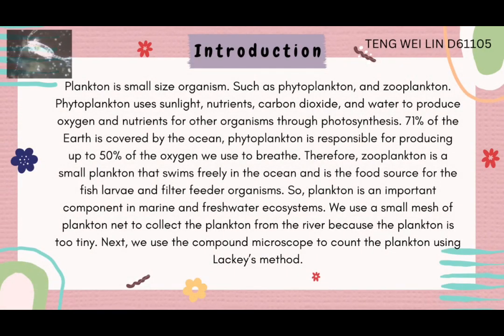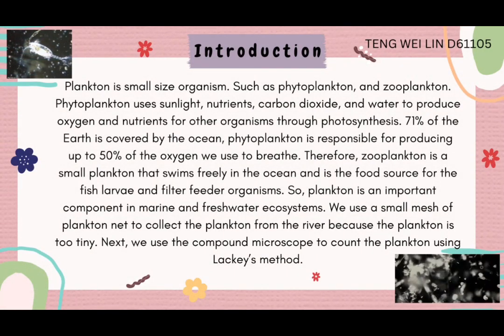This I would like to present the lab practical for plankton. Phytoplankton are small cell organisms. Phytoplankton use sunlight, nutrients, carbon dioxide, and water to produce oxygen and nutrients for other organisms through photosynthesis.